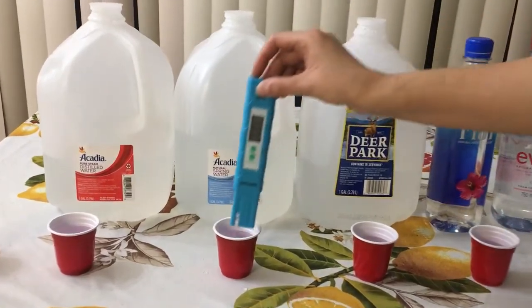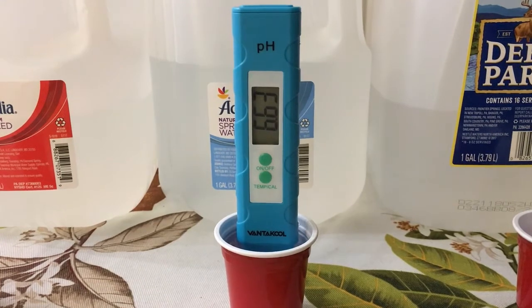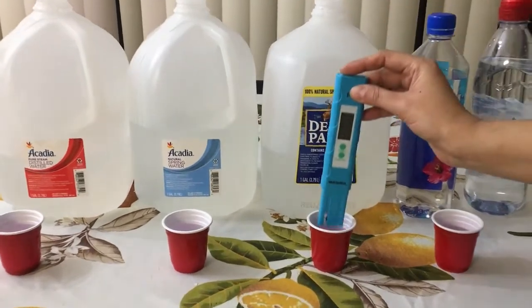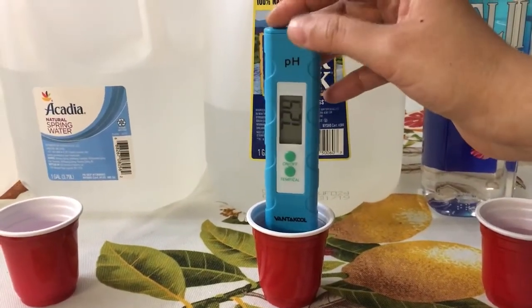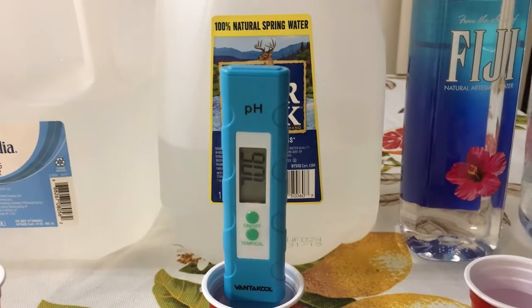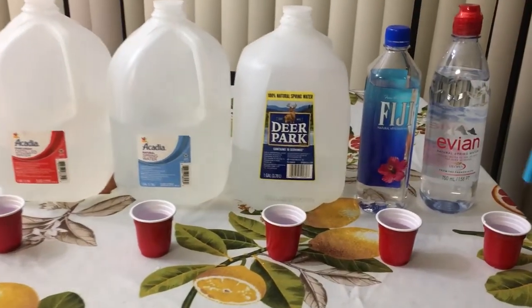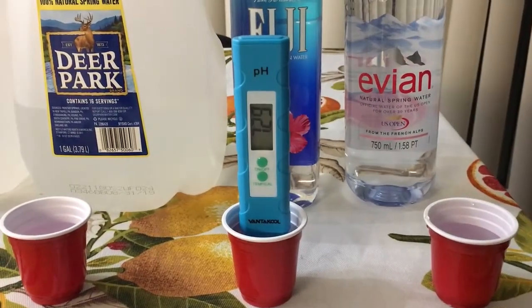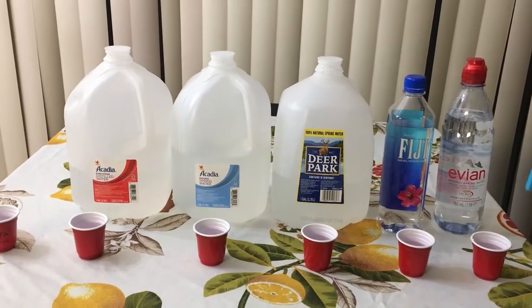Now for Acadia spring water. Let's move on to Deer Park. Now let's test for Fiji. And finally for Evian.